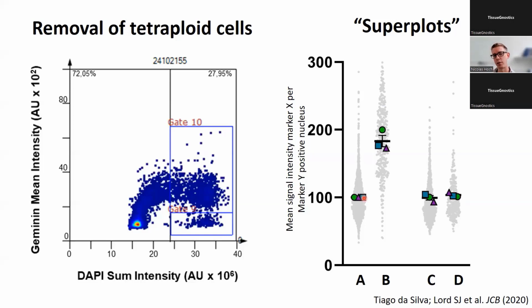But when you do that, you actually lose the richness of information that went into generating these averages. And you cannot use individual cells for each experiment as independent Ns, right? We couldn't say we have 6,000 N for this experiment, because that's not what we did. But you can show the underlying data in your final graph using what they call a superplot, which we find very useful to show the heterogeneity that's actually happening in the tissue culture dish.